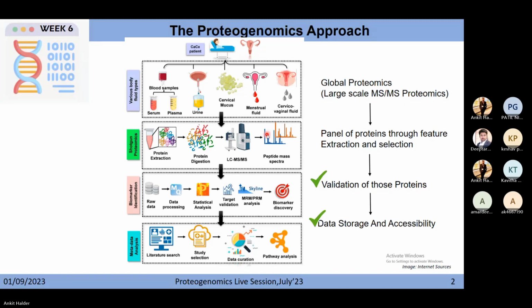The reason is that during the collection in the tube for one batch of patients, due to some reaction in that tube, that protein was getting modified or something was happening, which led to the identification of differential expression of that particular protein in those patients. So that's why it becomes very crucial to use a different method, add a different set of things, to become truly sure that what we are doing is not an artifact.